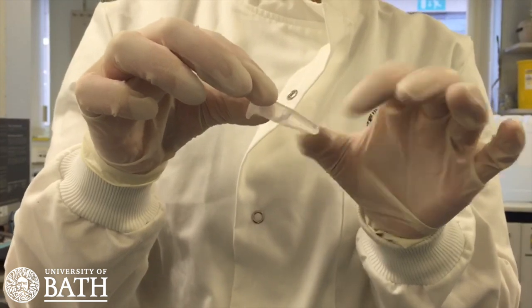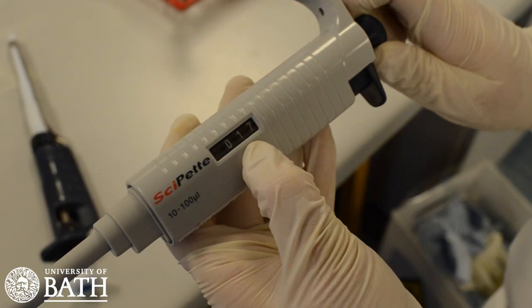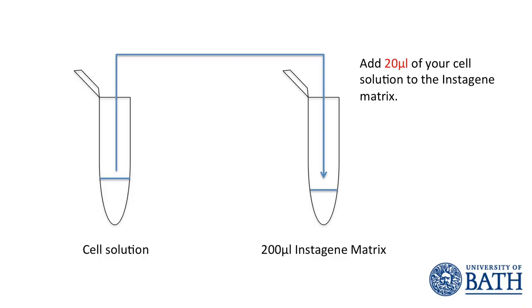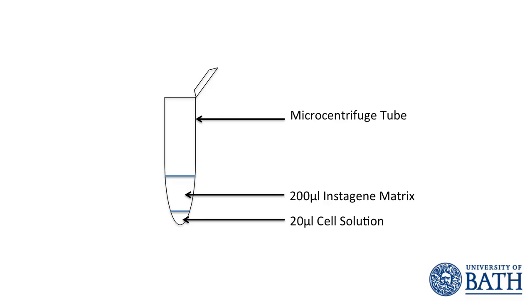The microcentrifuge tube then needs to be flipped or shaken until the cells are resuspended. Using a smaller micro pipette, take 20 microlitres of your cell solution and add it to another pre-prepared microcentrifuge tube containing 200 microlitres of the instagene matrix. Alternatively, the instagene matrix can be added to the cell solution. It does not matter which order the components are added, as long as your new microcentrifuge tube contains 20 microlitres of your cell solution and 200 microlitres of the instagene matrix.